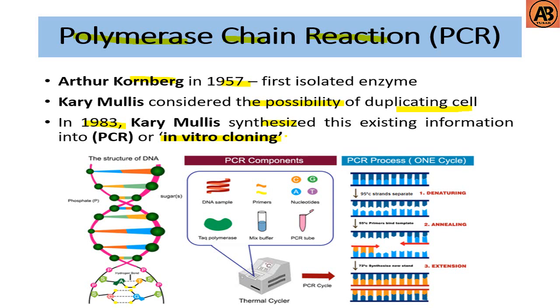In technical terms, PCR may be defined as a rapid procedure for in vitro enzymatic amplification of specific DNA sequences using two oligonucleotide primers that hybridize to opposite strands and flank the region of interest in the target DNA. In this video we are going to learn about the PCR in details. So let's get started.